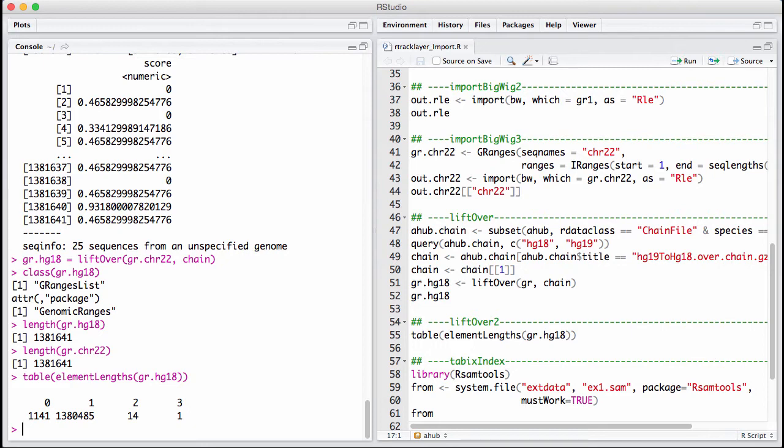The HTML page associated with this session has information about Tabix indexing, which allows you to parse parts of certain file formats much faster. If you want to read in very big BED files or BED graph files, I suggest you read that section. That covers using RTrackLayer to import data from UCSC.